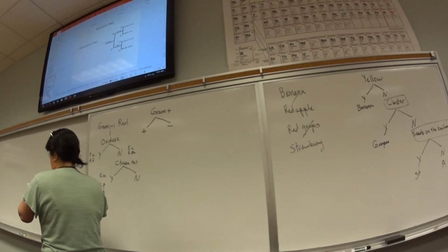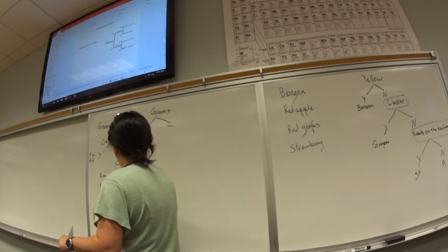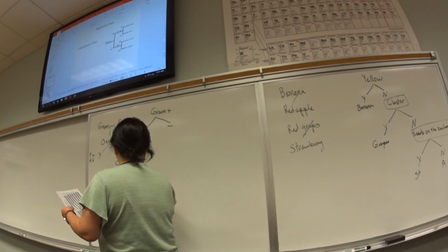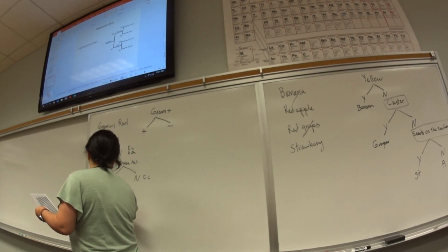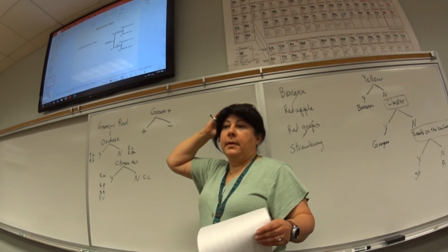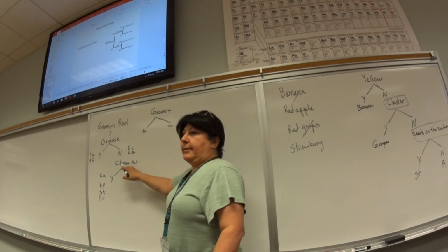All right, so that's because we are just among those. 1, 2, 3, 4, 5 of them. And then on here, we're going to have E. coli, P. vulgaris is positive, negative. So it could be one of those. This wasn't a good choice to have right here. But let's say it was positive. So if it is negative, you're done.